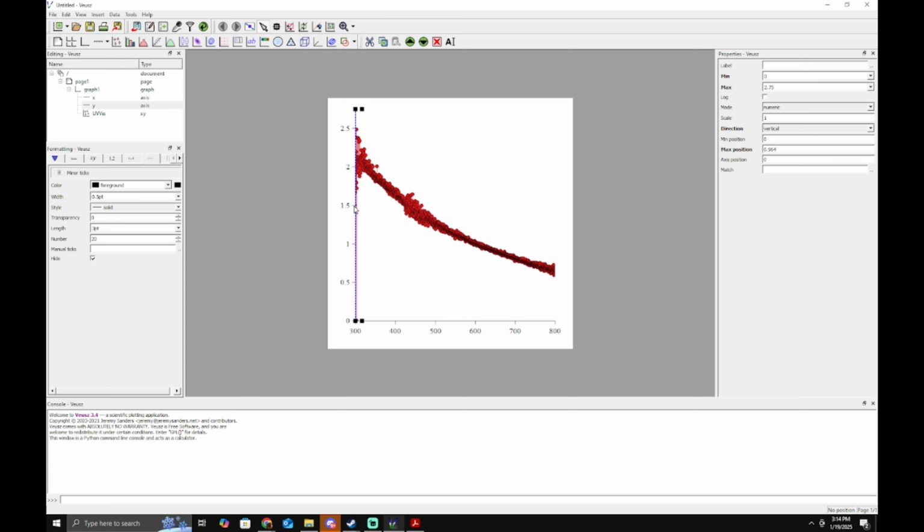We also need some labels, so I'm going to go over to my Y again, and where it says label, I'm going to add absorbance, and then its units. And you can do this however you want. If you want to use parentheses, that's fine. I tend to use lowercase with slash, but it's all up to your choice. And then same thing over here, we'll change this up. Wavelength, if I can spell it correctly. Did I spell that right? Looks right. And then this is in nanometers. And now we have our labels.